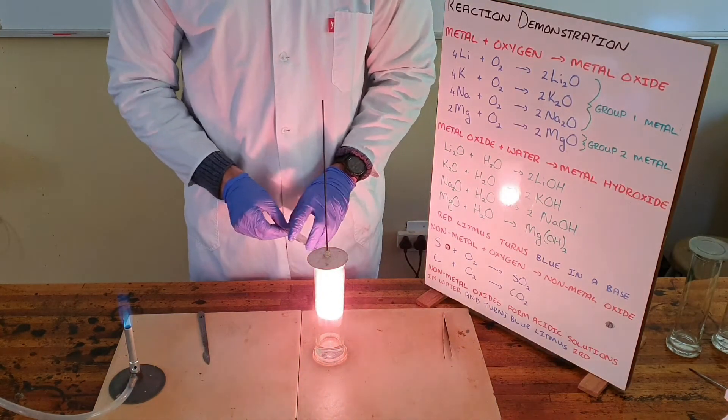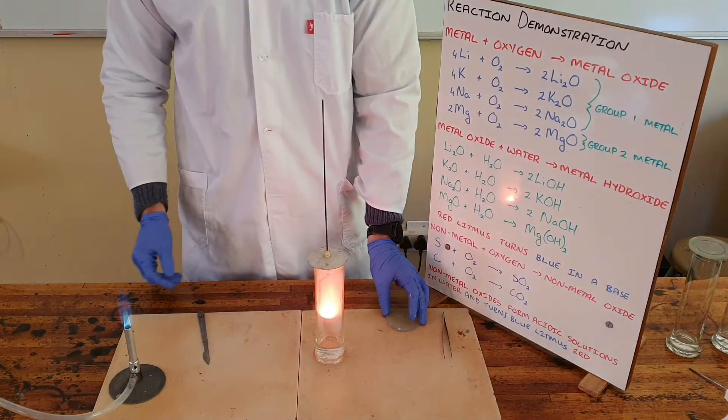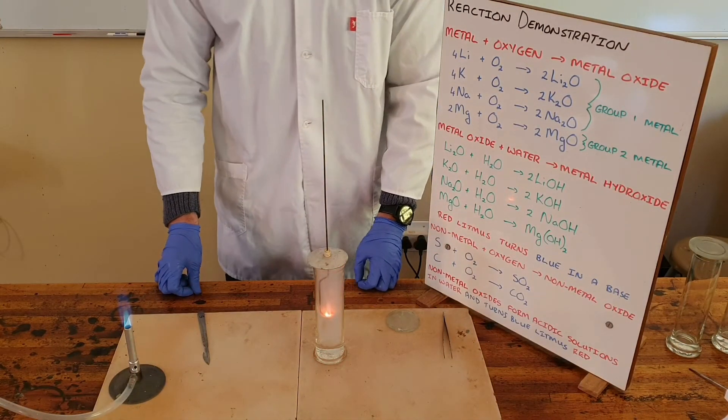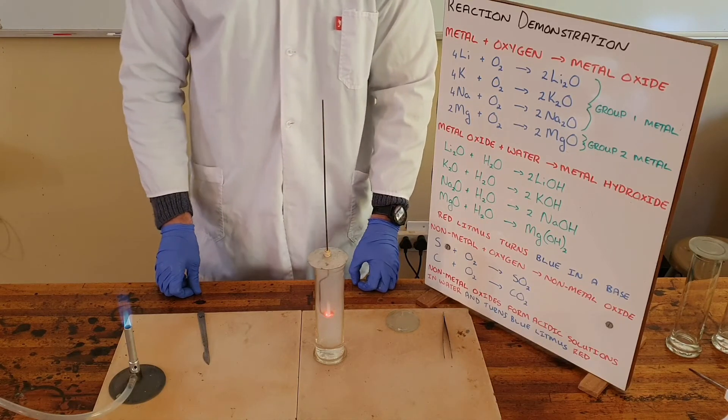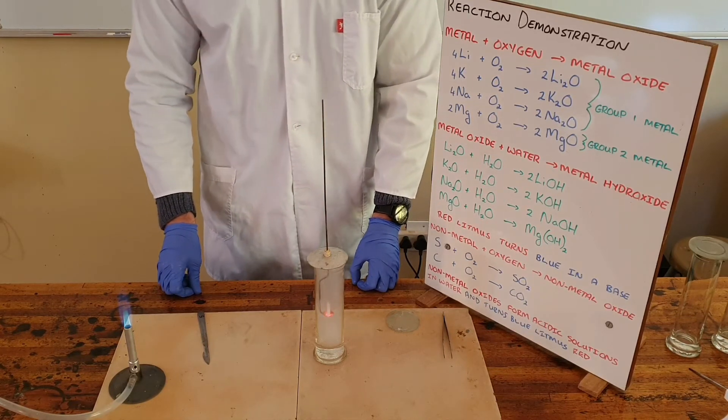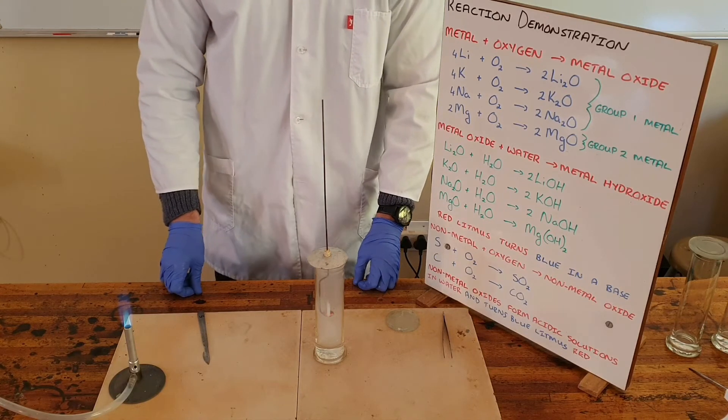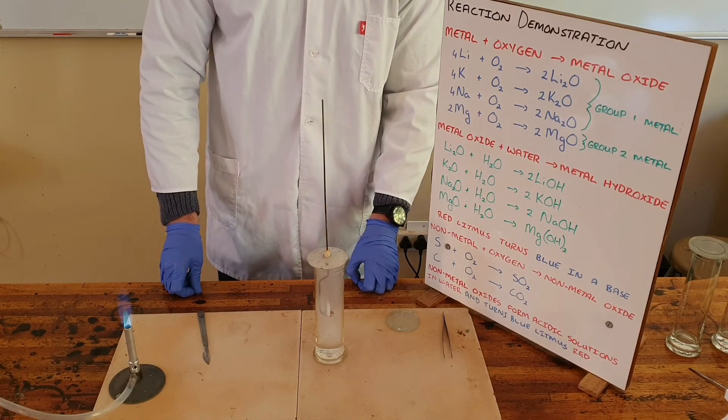We can see that the reaction happens far faster—there's a far more rapid reaction in oxygen. That is because the pure oxygen allows the reaction to proceed much faster. We can see that there is a white smoke formed, and that also forms along with the metal oxide that is formed, the lithium oxide.